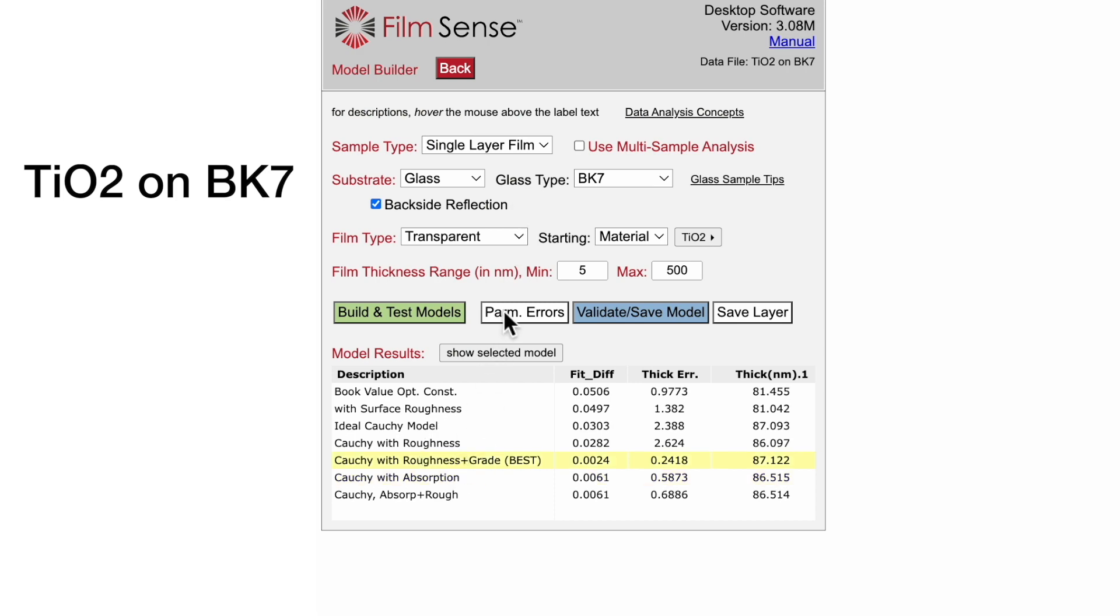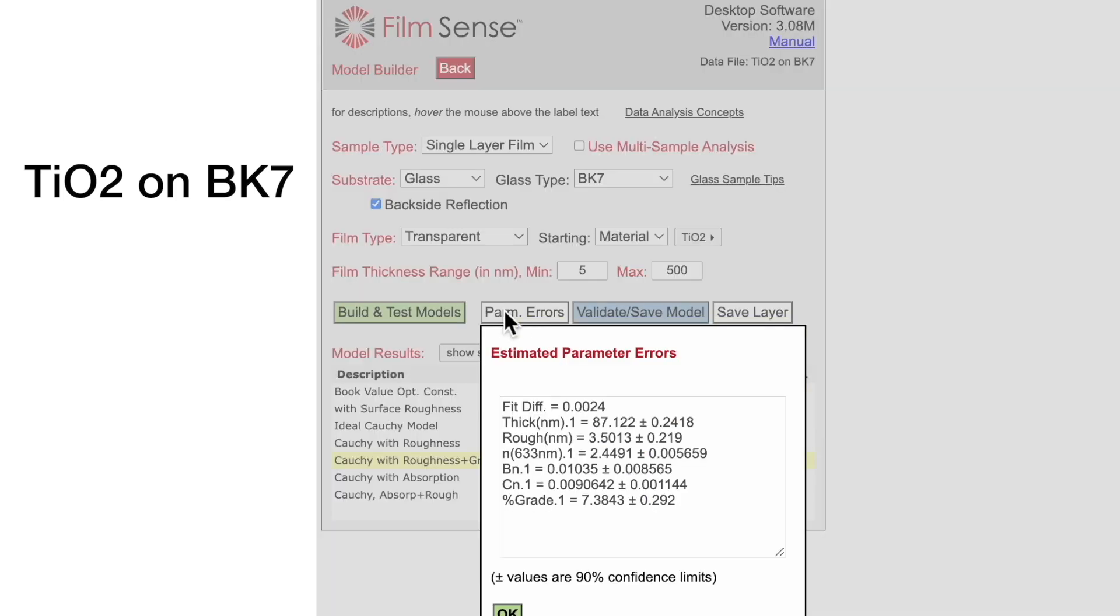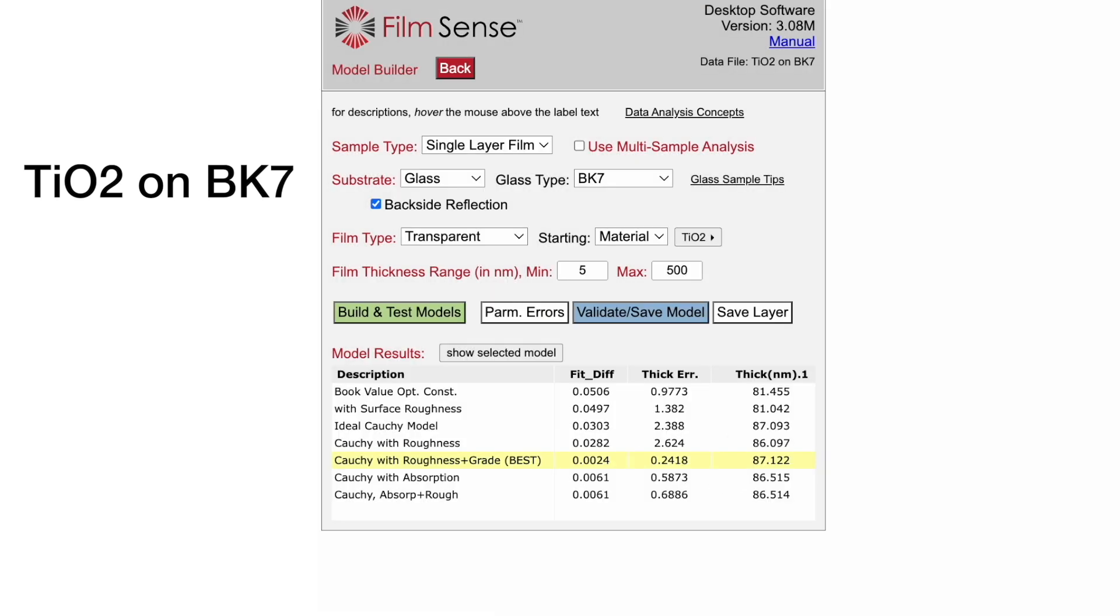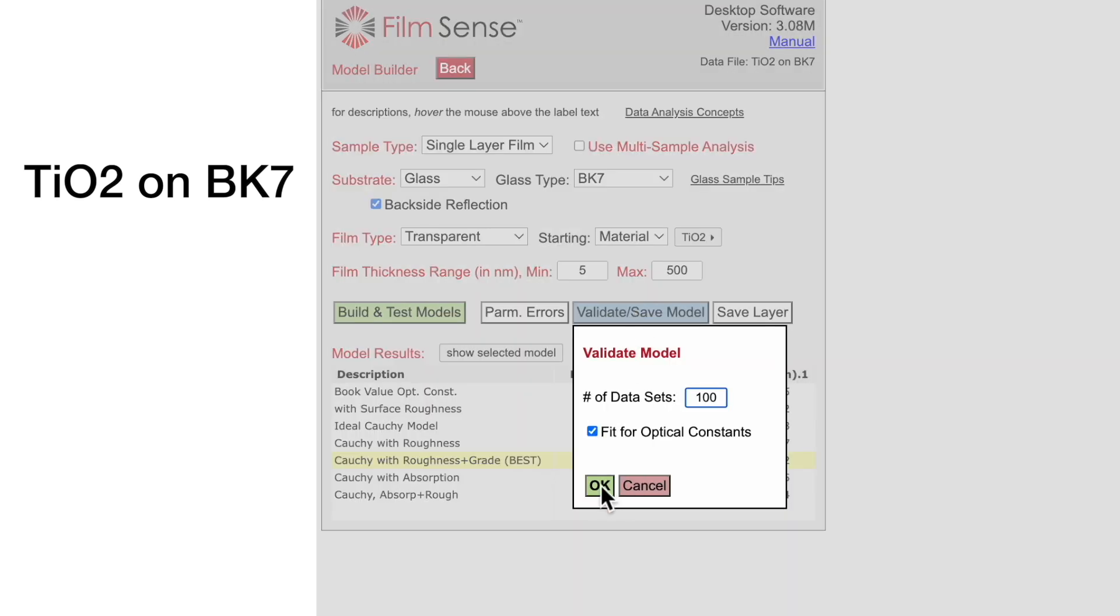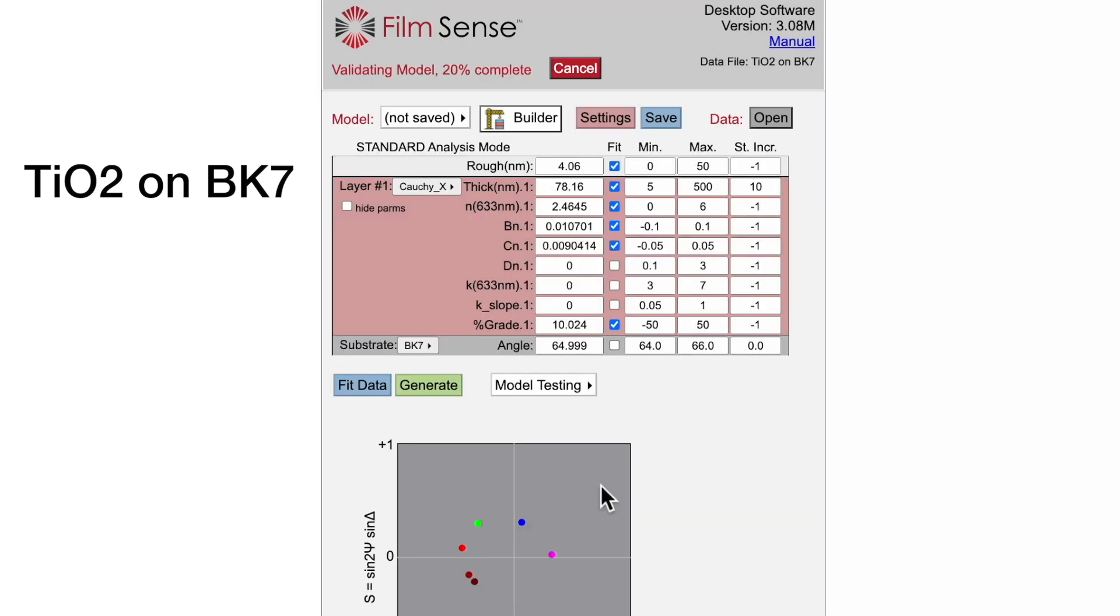In spite of its complexity, the best model still exhibited acceptably low error bars on all the fit parameters, and good model fit convergence over the full thickness range.